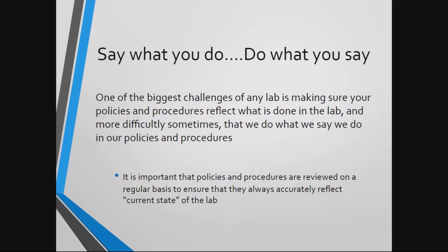Probably one of the biggest and most consistent challenges I see in the histology and cytology areas, and really the lab in general, is the concept of saying what you do and doing what you say. And by this I mean to ensure that your policies and procedures are current and accurately reflect the current processes, policies, and procedures that are in place. And just as important, make sure staff know what your policies and procedures say and are aware of how things are supposed to be done.